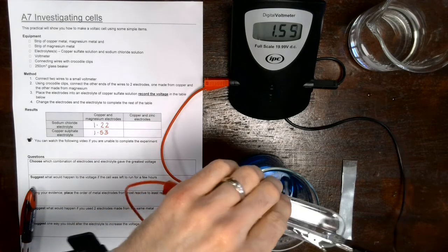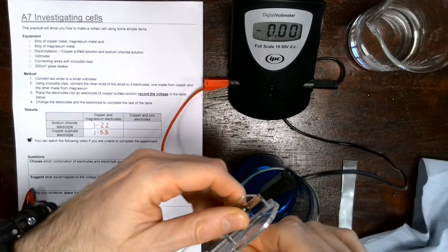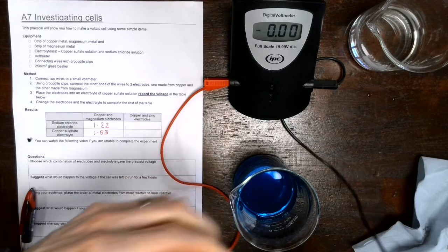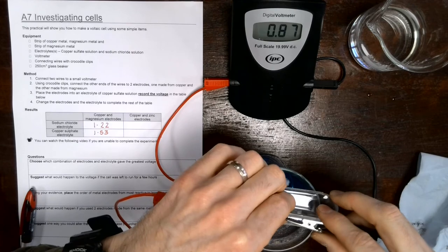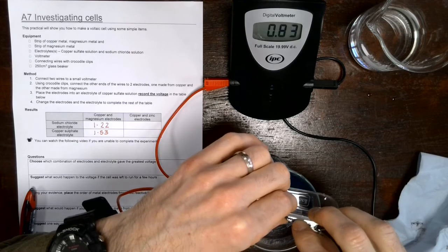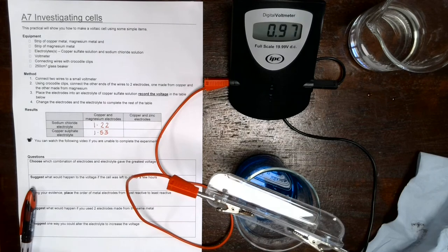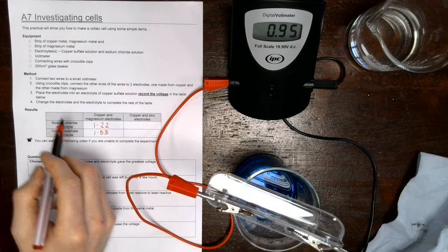Now we need to swap and change the electrodes. We're going to be using copper still, but we're going to swap the magnesium for zinc, so the zinc electrode can now be connected up. Let's go back to, we'll stay with the copper sulfate while we're here. Let's just move this down ever so slightly so they actually go into the electrolyte.